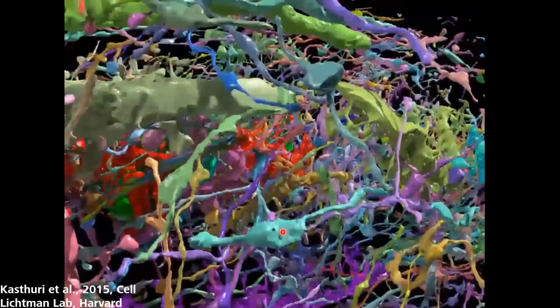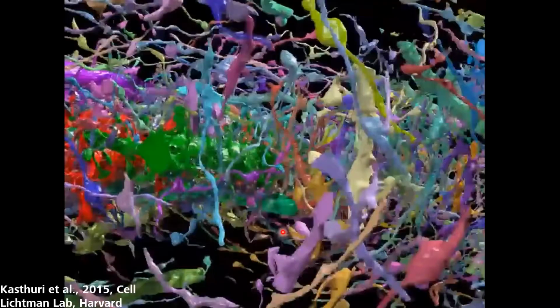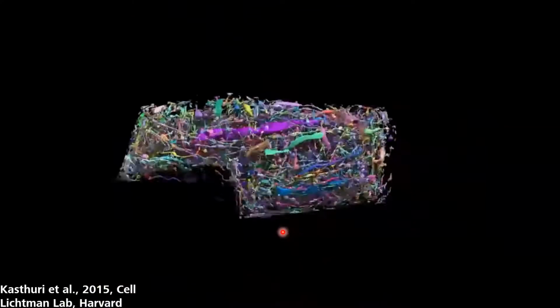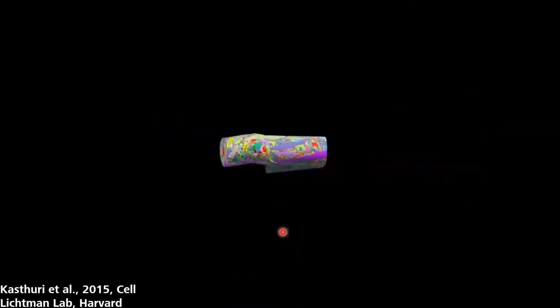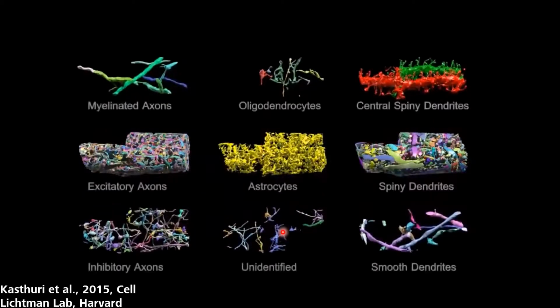And all these details that you see, this is actually the richness of the brain and all the structures inside. So light microscopy would not get you there. This is something you can exclusively do with something like electron microscopy, where you see all the membranes and eventually all the processes contained in there. What they did is not only reconstruct all the structures, but use local features in the electron microscope data to classify what kind of structure we are looking at.